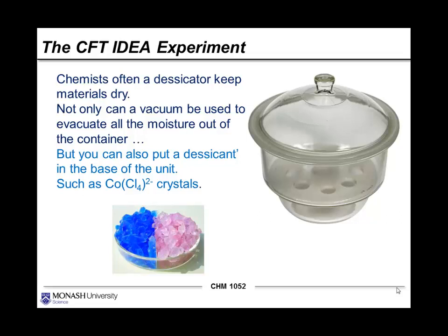This is a cobalt coordination compound. Actually, when it's still in this form, we can say that the material is generally pretty dry. However, over time, this coordination compound is very good at reacting with water to give this material here, and it has a very different colour. The cobalt metal centre is still in a 2+ state, but the ligand on that metal centre has changed.